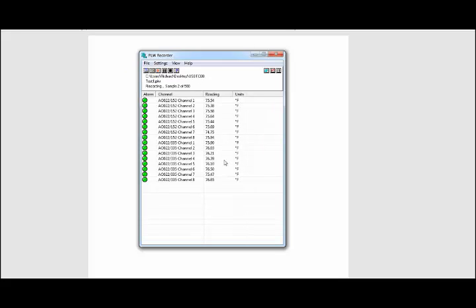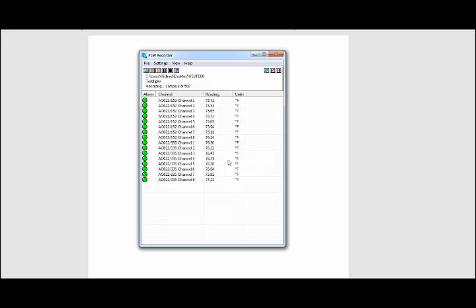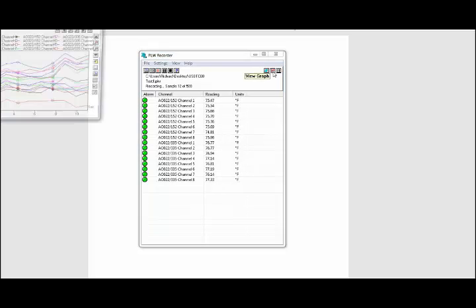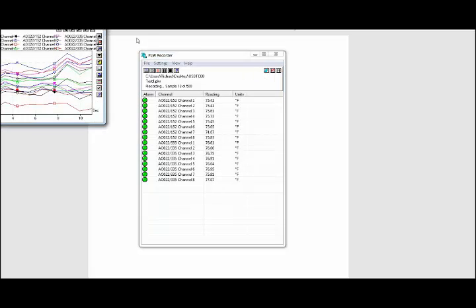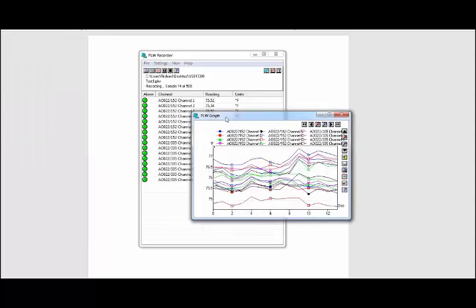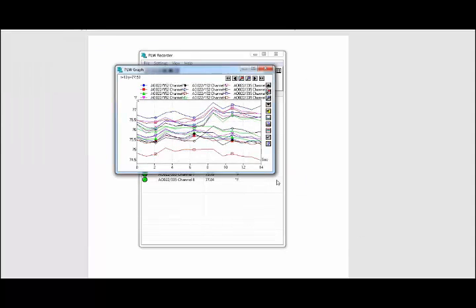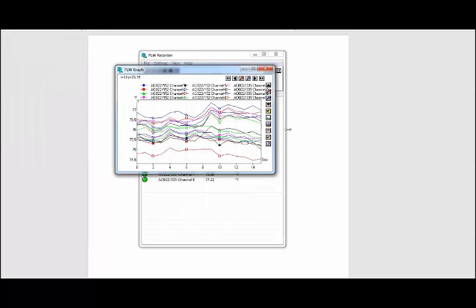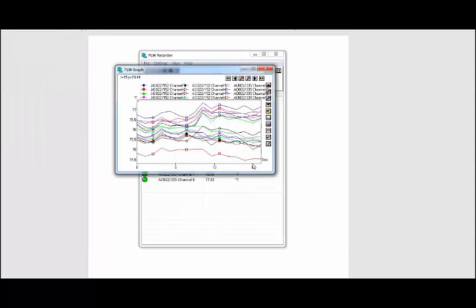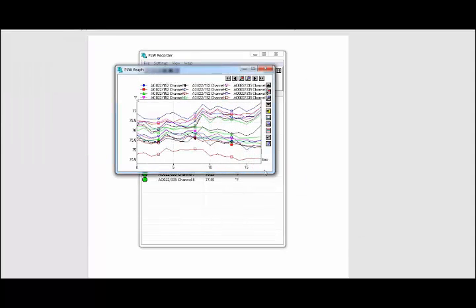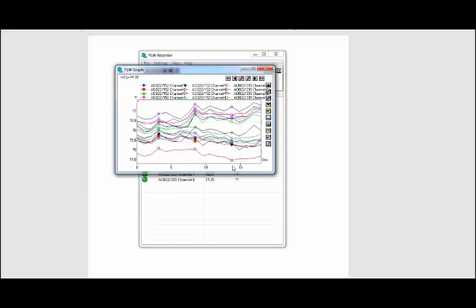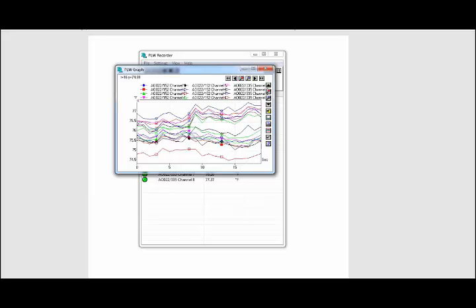The device is now logging for both units, all 16 channels. If we want to display the temperature readings while it's logging, we can click this graph button right here. It will bring up a graph with all 16 channels displaying over the period of time that you're logging.